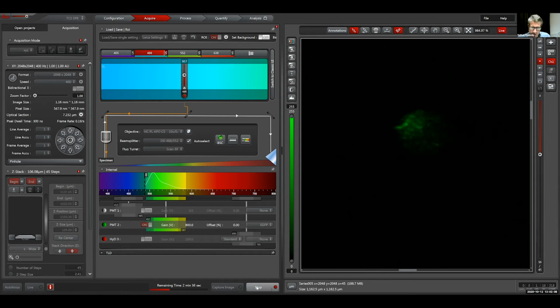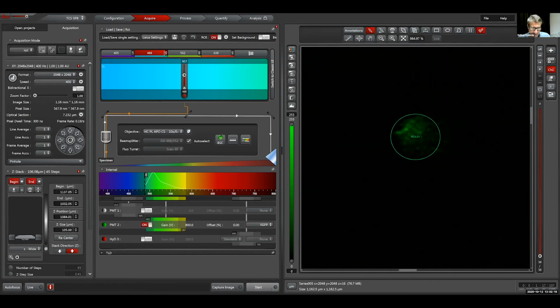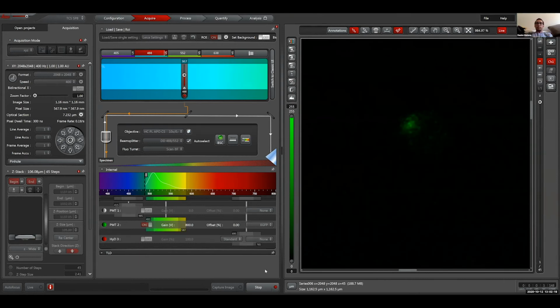All right, that was about enough. I'm going to do one more pass. Does it make sense what I'm doing? Yeah. I don't care about finishing the Z stack. When the cell is there, I just scan through it at 50% 3 times. Okay. And then we'll go back and we'll remove the region of interest and just do the whole brain. Okay.